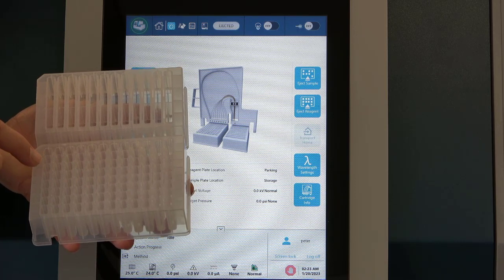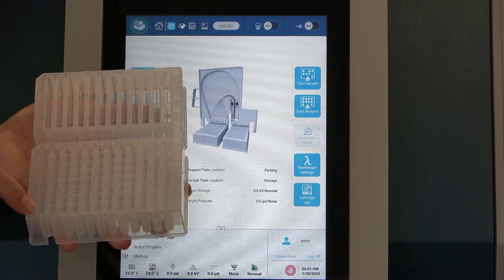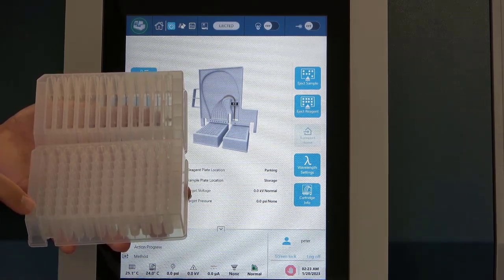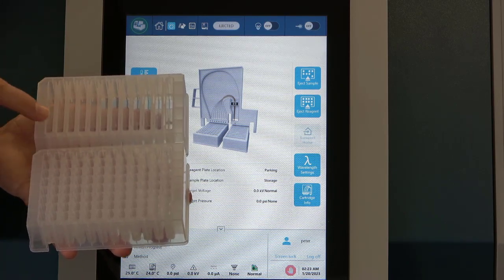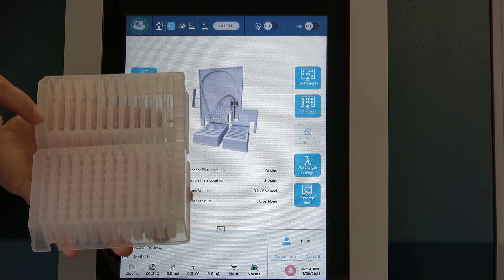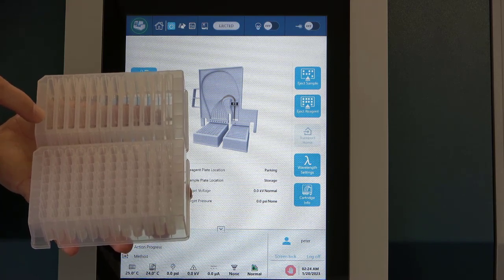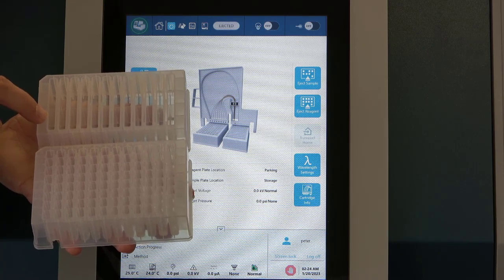And each capillary is going to go into its own independent reagent well. So each one is going to be rinsed independently. Each one is going to be electrophoresed independently. And then on the outlet side, we use more of a trough-based system. So here, all those 8 capillaries will go into the same location as either a waste vial or the other end of our electrophoretic separation.